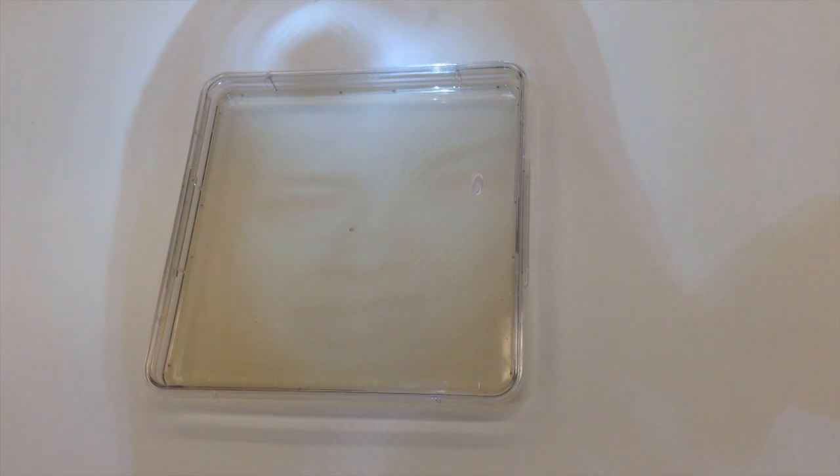I expose the plates to radiation for about an hour, then after that I put them in the incubator. After a few days in the incubator, this is what comes out.